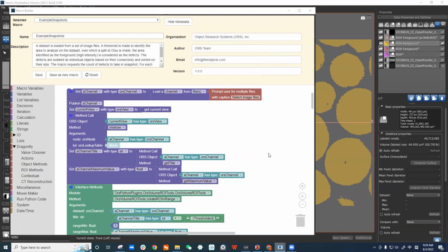So I'm going to read the questions. Eduardo says, how do we generally define landscape and mask for watershed filtering? Well, for watershed, we normally use an image which has higher intensity on the edges, on the boundaries.